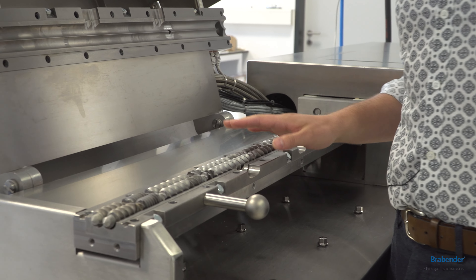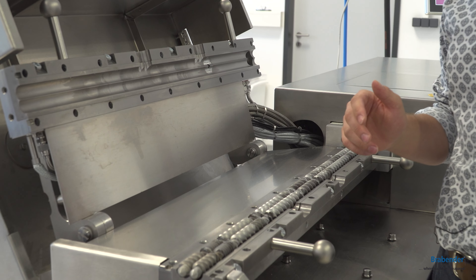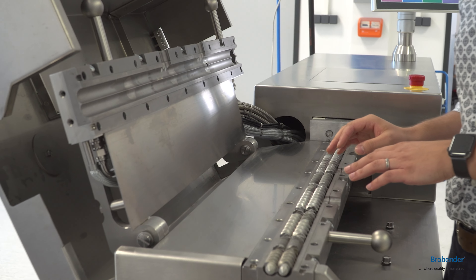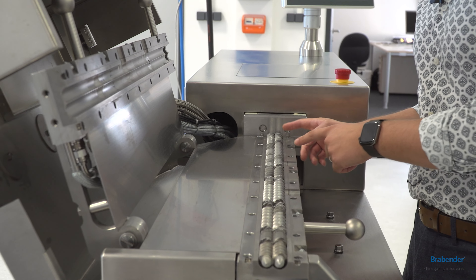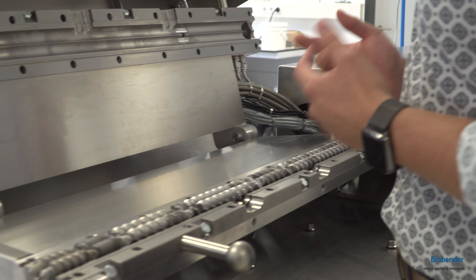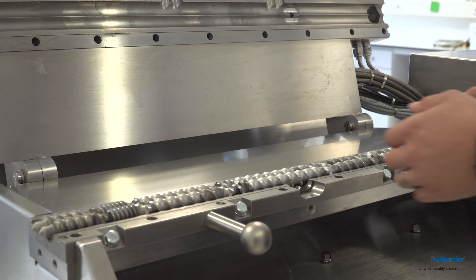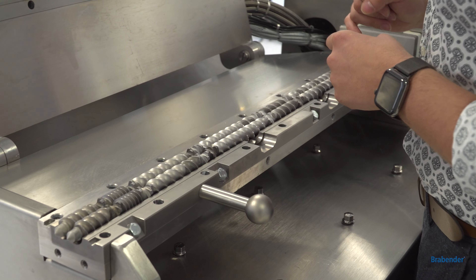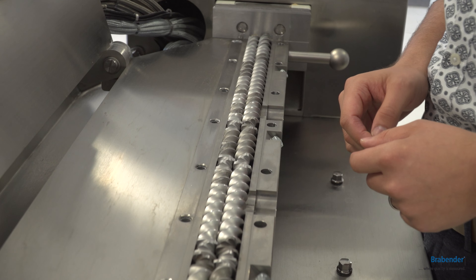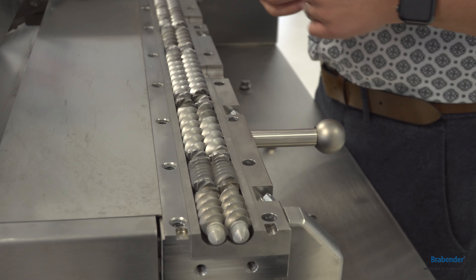This comes in handy before you clean your whole system. You can run your process as you wish, and then by opening these screws you can have a visual and very close look inside the process. This is useful if you want to find out how your polymer behaves during the process. Many of our customers use this function because they want to change the screw configuration or see how the polymer behaves in kneading blocks, conveying elements, and so on.